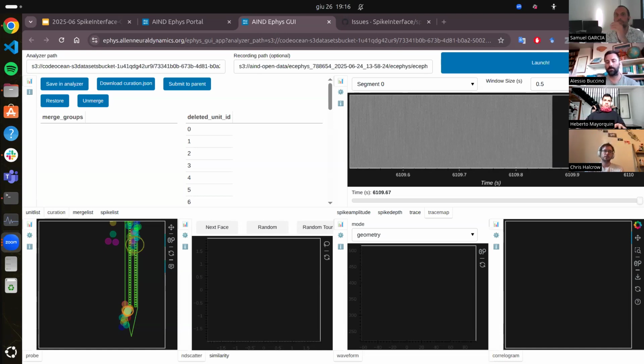But maybe it could be interesting to explore some additional extensions or functionalities to pre-process the cross-correlograms and find putative excitatory and inhibitory connections across your spike trains based on the CCGs, and then provide this information to the GUI as visual feedback. But currently, this is not baked in, so it would be hard and complicated to make sense of this just visually.